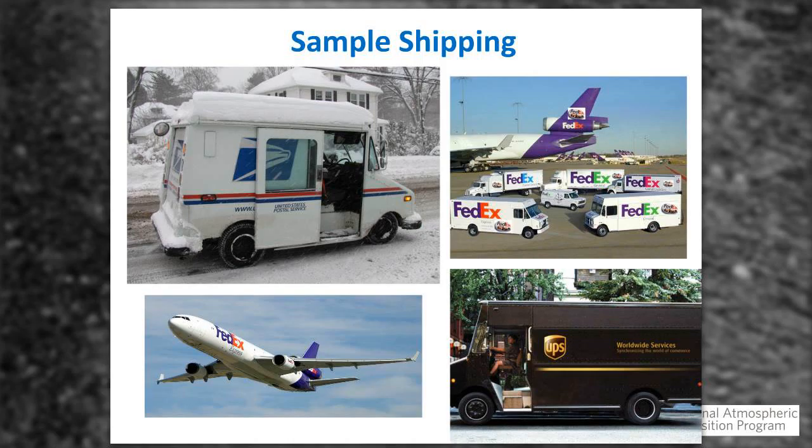Samples, standard post, first class mail, or equivalent is acceptable. So is UPS Ground. There really is no need to pay for supplemental next day shipping unless some government contract has that stipulated as part of their cost structure. And again, this is really case by case basis. If you have any questions or concerns, just feel free to contact us.